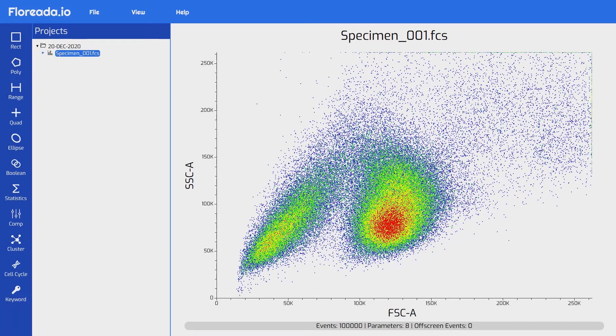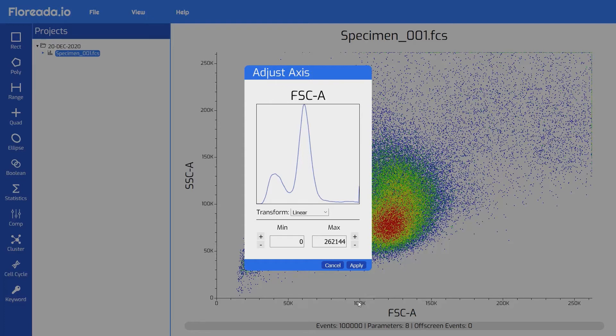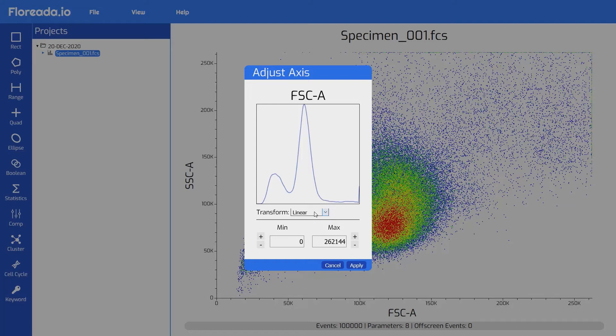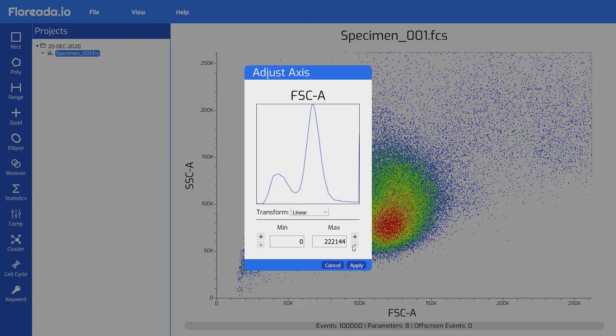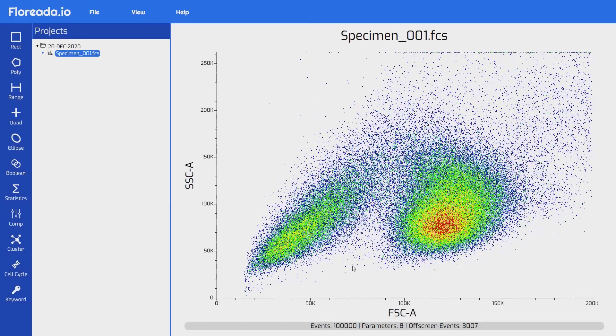If we'd like to adjust the scaling of the axis, we can just select the axis itself. That brings up the adjust axis menu. From there, we can select for multiple transforms for the axis, including linear, logical, logarithmic, and hyperlog. I'm going to keep it on linear for now. You can also adjust the min and the max for the axis. You can see that we get a preview histogram to help us select the most appropriate axis for the data. You can also just type in the number that you'd like. Once you're happy, you can click apply. You can see that our X axis has shifted on the dot plot.